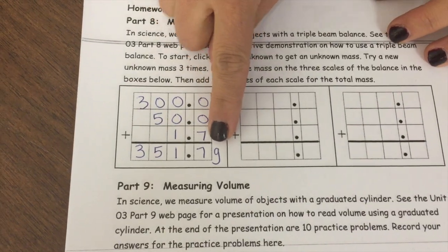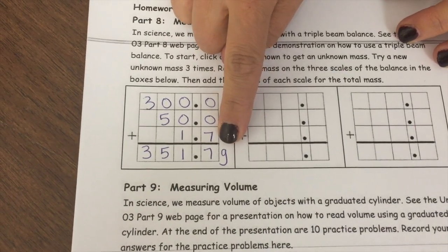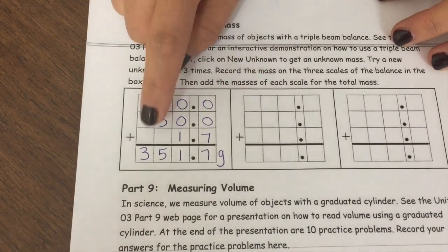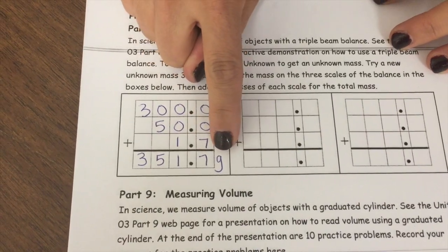It's important to make sure that you write a unit at the end. So right now we're measuring in grams. So it's 351.7 grams.